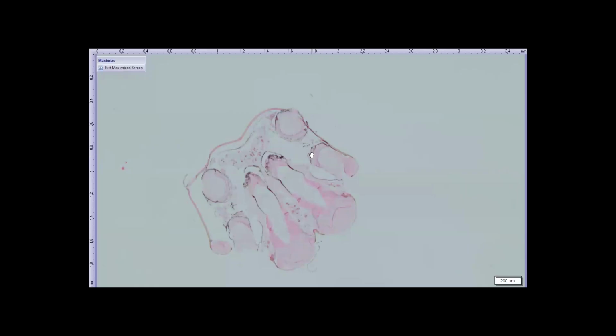So the jumping spider is a predator, and it catches things by jumping on them. So it has these gigantic eyes that point forward, and you can see them. They have the appearance of being like a telescope. They're very long. This is cut in the coronal plane of the head. So here would be the front where it's looking. Here's the back of its head. On one side of this would be the bottom, and the other side would be the top of the head.